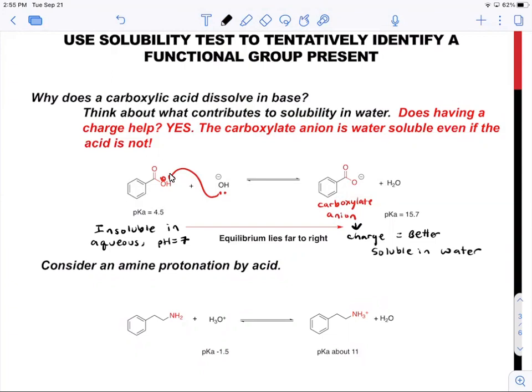So what you might find for this carboxylic acid in the lab is that if you place the acid itself into a test tube with water at pH 7, you'll observe only a solid, meaning very little of the molecule dissolves into solution. It's insoluble. However, as you go to aqueous solutions that have a basic pH greater than 7, you will notice the solid will in fact dissolve.